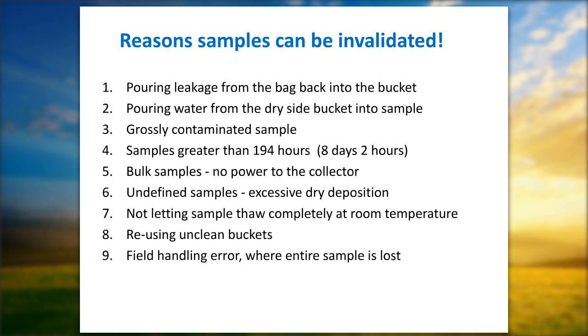So first of all, if there's any leakage into the bag, once something leaves the bucket, it doesn't go back. It's a one-way trip. So if something leaks out of the bucket, don't ever attempt to pour it back. And again, please.